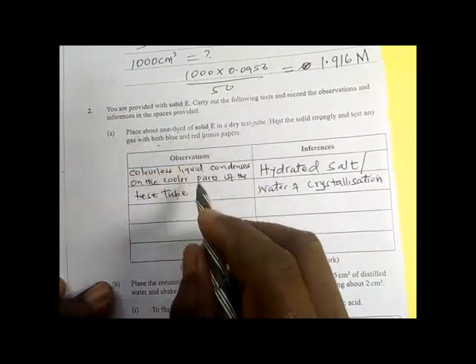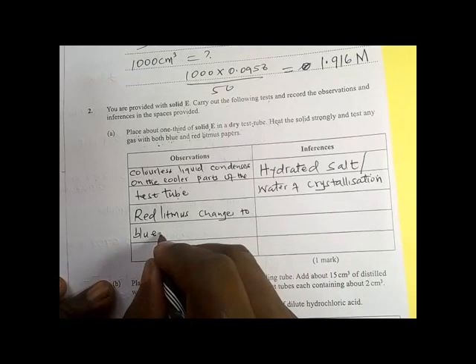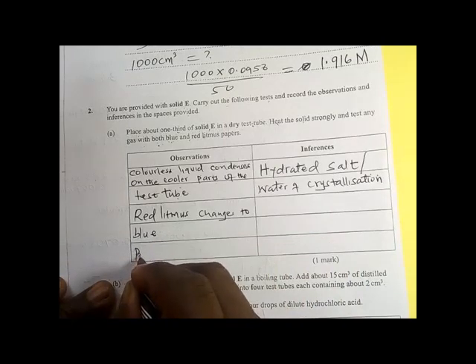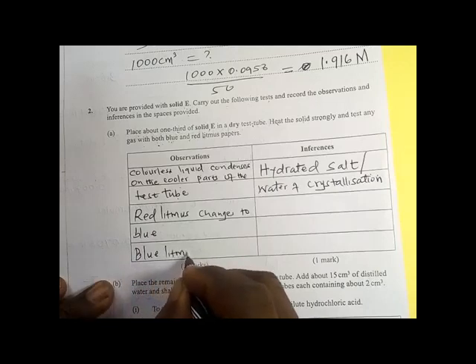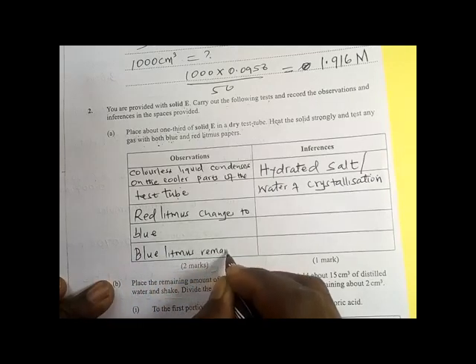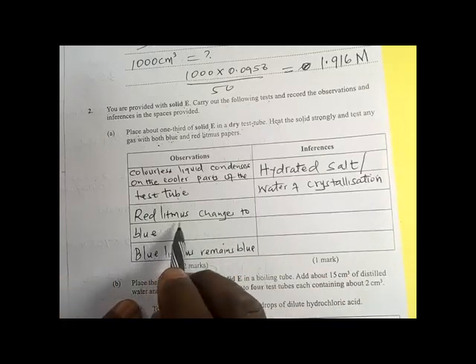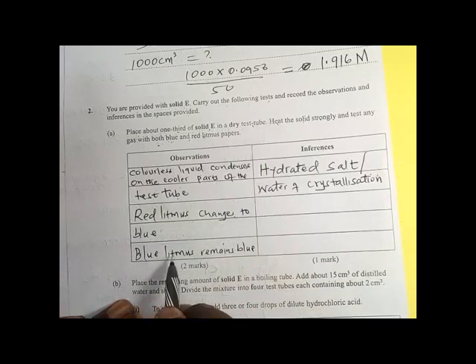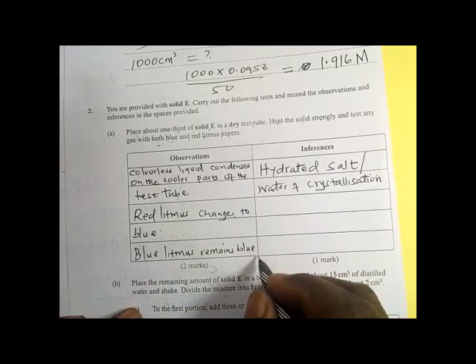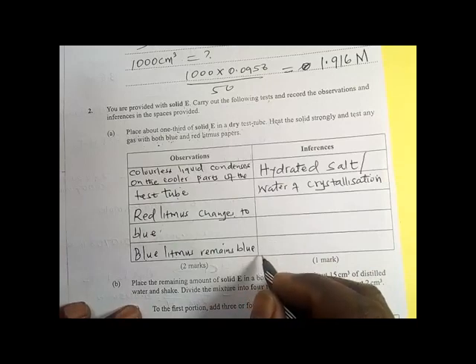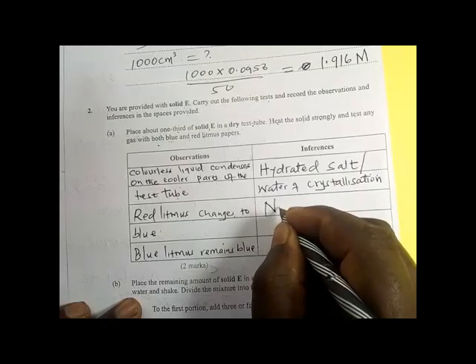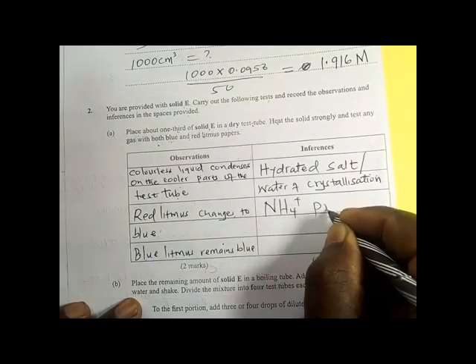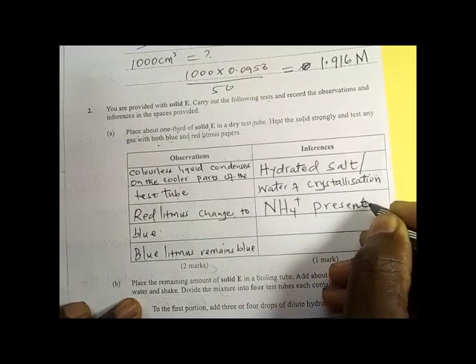What happened to the red and blue litmus paper? Red litmus paper changes to blue, and blue litmus paper remains blue. So if red litmus paper changes to blue and blue litmus paper remains blue, that confirms that the gas produced is a basic gas.